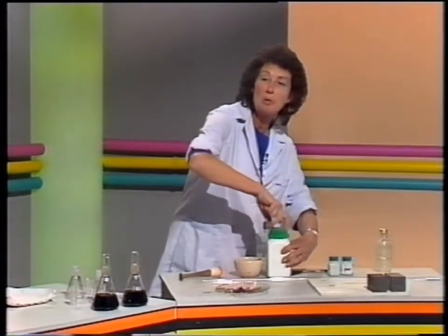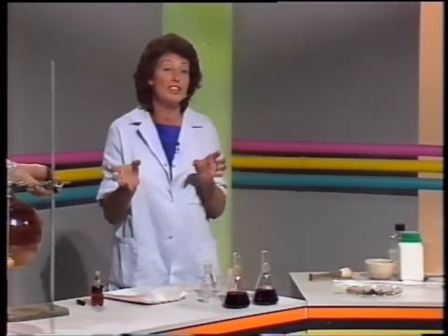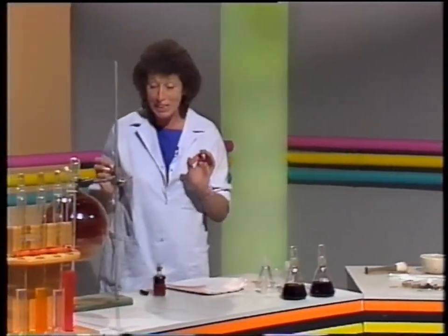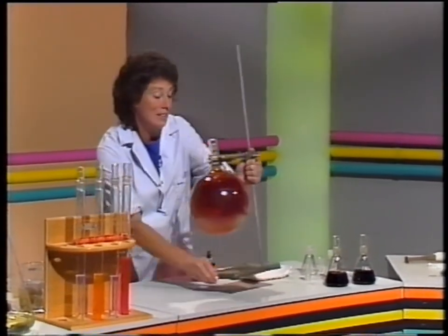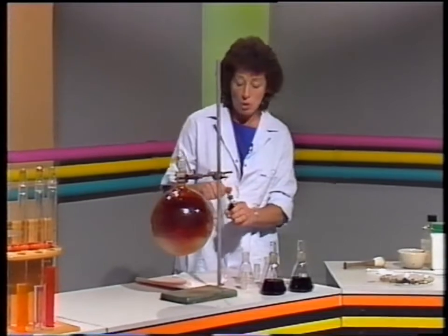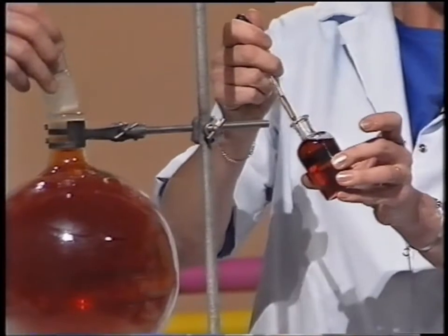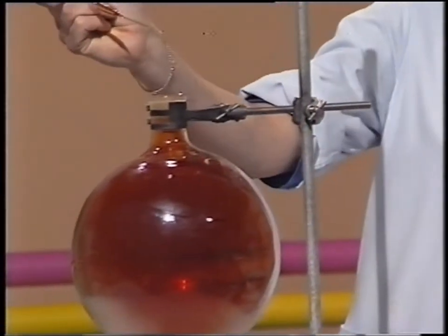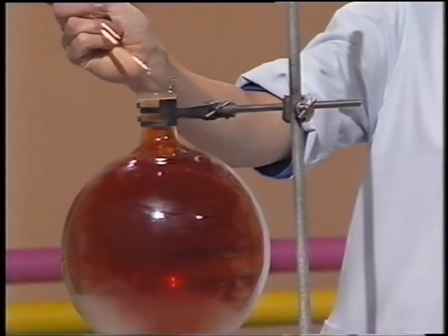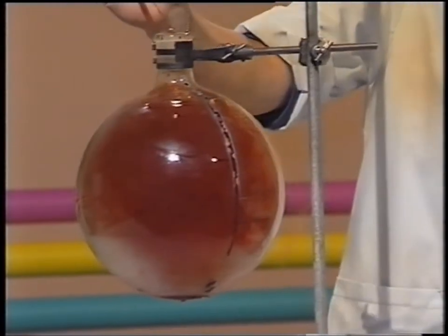Now, I don't want to send you all to Mars or the Moon this afternoon, so we've got to be a bit careful about the reaction. But this reaction is the type of reaction that they actually use to launch a rocket. This is the sort of thing they use as rocket fuel. We've got nitrogen dioxide. If I had hydrazine here, you'd all end up on the Moon. But I don't think we'll do this. But just to show you how vigorous a reaction this is. And on a large scale, that would be able to launch a rocket. That's the type of reaction we would use.